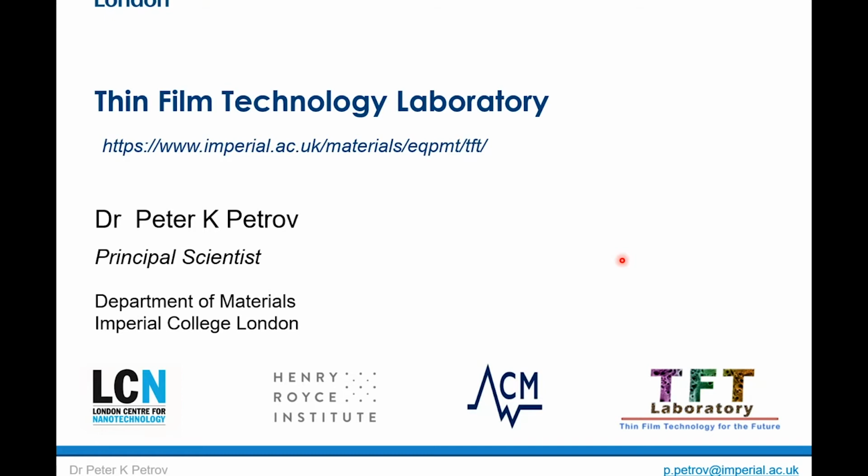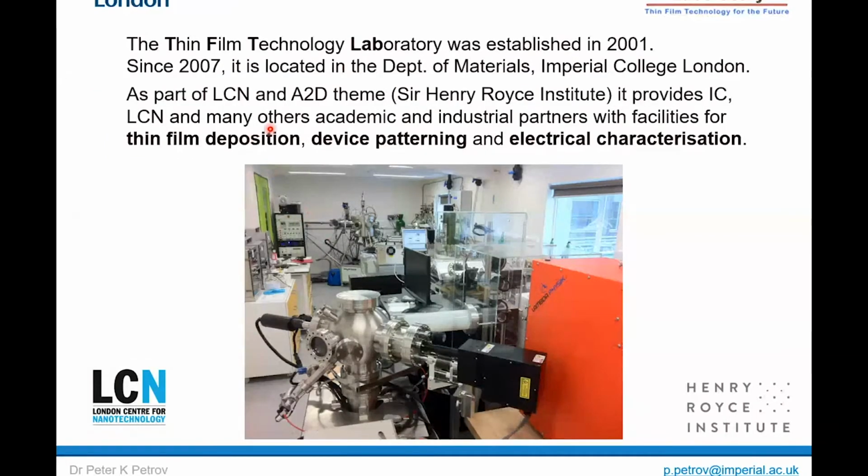Our lab was established in 2001, and since 2007 it's been located in the Department of Materials. It's a founding member of LCN, and more recently we are also part of the Atom to Devices team of the Henry Royce Institute. In the lab, we provide Imperial College and all LCN partners, as well as other academic and industrial partners, with facilities for thin film depositions, device patterning, and electrical characterization.